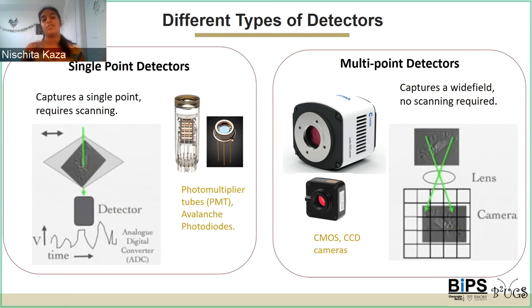The commonly used cameras for scientific imaging are usually CMOS or CCD, and this basically just refers to the technology used for converting photons to electrons, then converting that to a voltage and storing it. We won't really get into the details of that, and you probably won't need to get into too much detail. With cameras, there are important considerations like the exposure time, and that again would depend on the quantum efficiency.